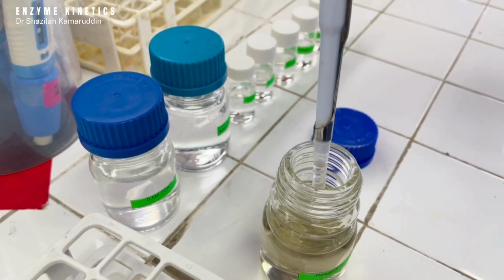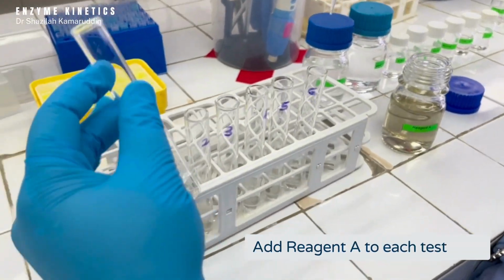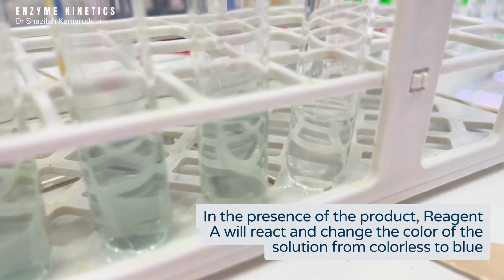Now that the reaction has been completed, we are ready to detect the product. Add reagent A to each test tube. In the presence of the product, reagent A will react and change the color of the solution from colorless to blue.